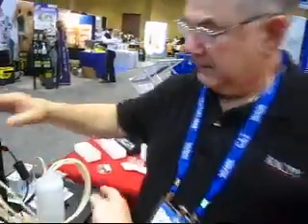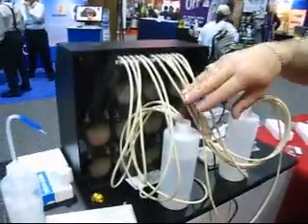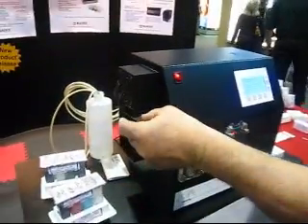The stains come in these type of bottles. Slides are finished — you will notice that it says 'remove slides and press OK.' You simply remove the slides and place them in the dryer.